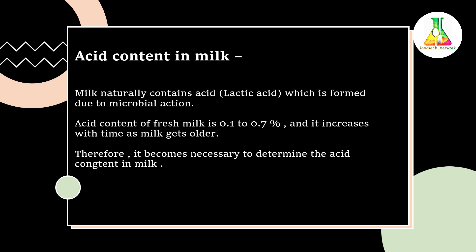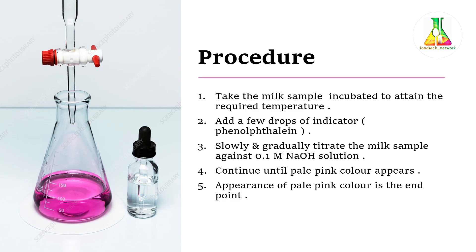Let us see how we do it. As you can see on your screens, it is again a type of titration. First of all, we need to take the milk sample, then add a few drops of indicator — in this case, phenolphthalein. Phenolphthalein turns pink in basic medium. We will slowly and gradually titrate the milk sample against 0.1 molar sodium hydroxide solution.